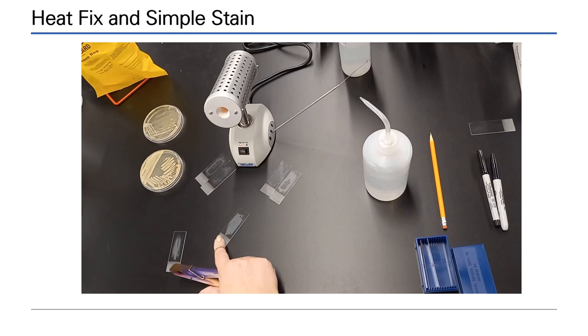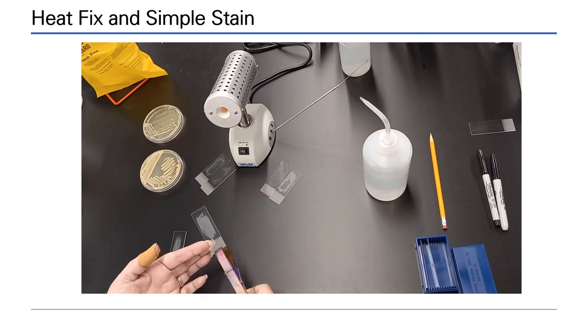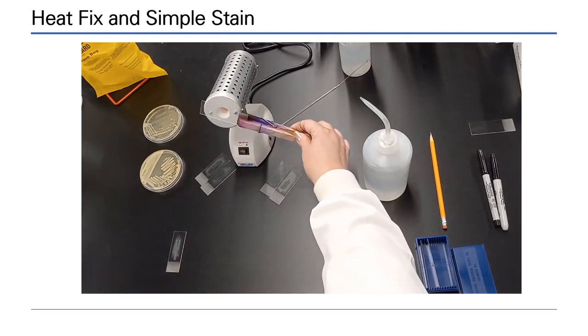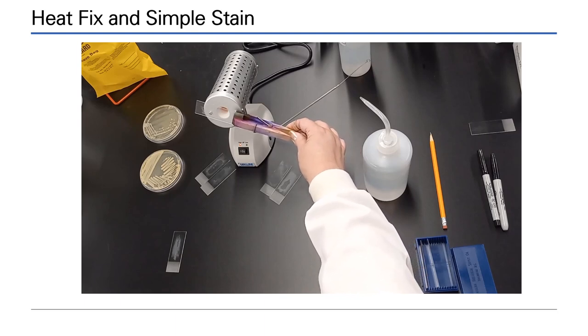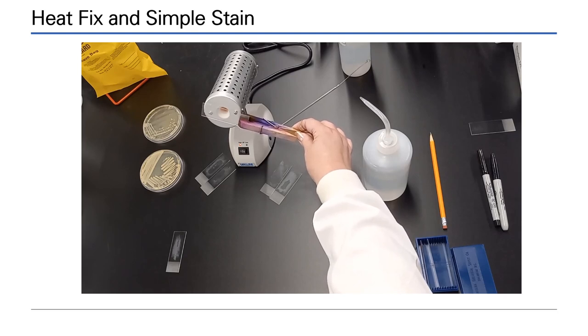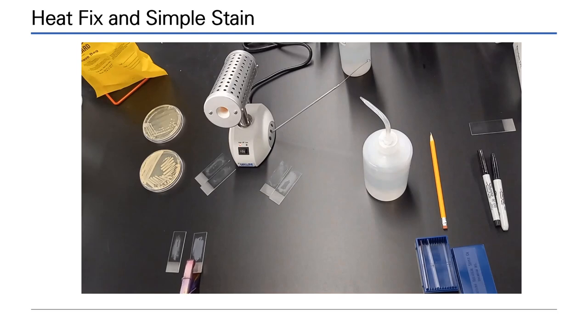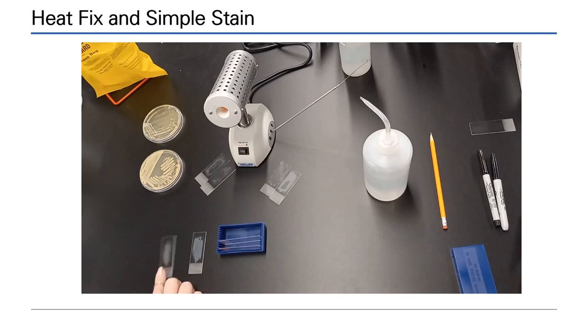Before staining a smear, you must heat-fix the cells so that they remain on the slide. Holding the slide in a peg, with the specimen facing away from the incinerator, apply heat at the mouth of the incinerator for up to 10 seconds. During this time, the heat will cause the proteins in the cell walls to stick to the glass slide. Allow the slides to cool. A heat-fixed smear can be stored for weeks before staining.